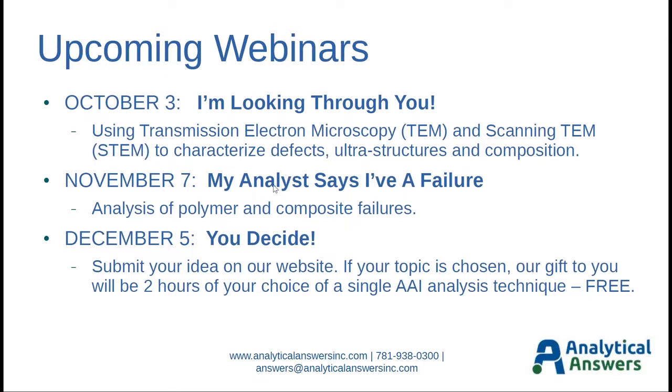Does this work on machine tool surfaces? Yes, I did mention that in the summary, that it is possible to look at cutting tools. Oftentimes the coatings on those heavier duty cutters are much thicker than you would want to do Auger depth profiling on, so more traditional approaches like mechanical sectioning and EDS might be appropriate, but it really depends on the application of that machine tool.